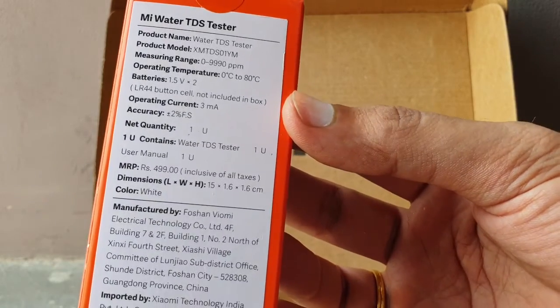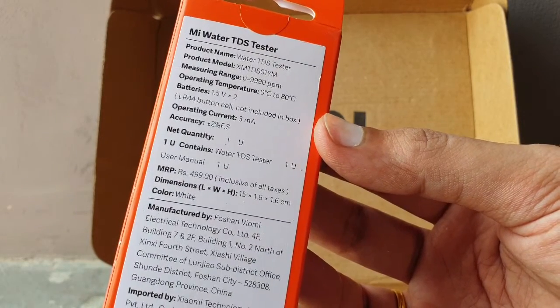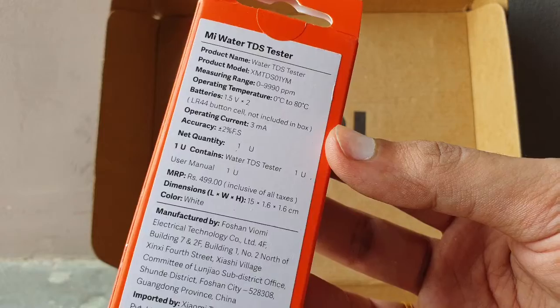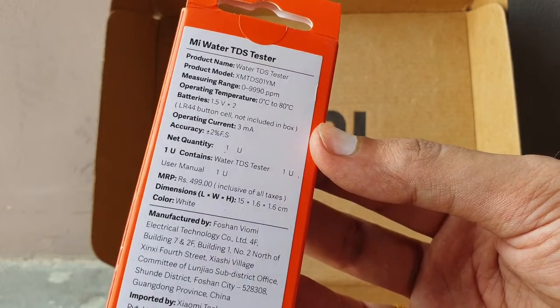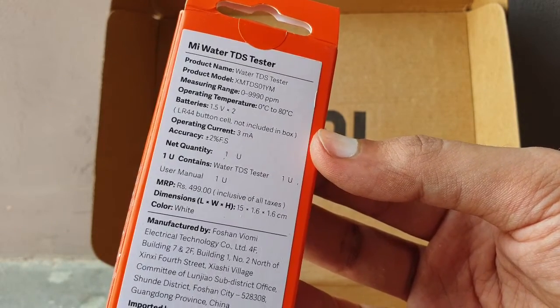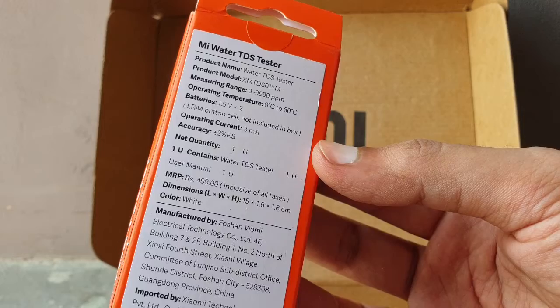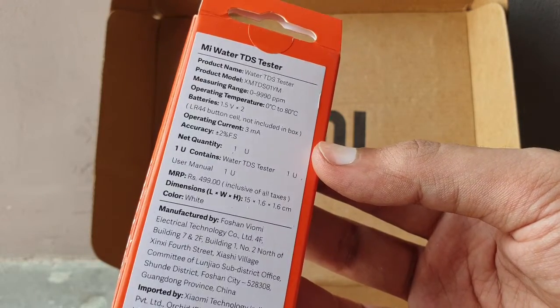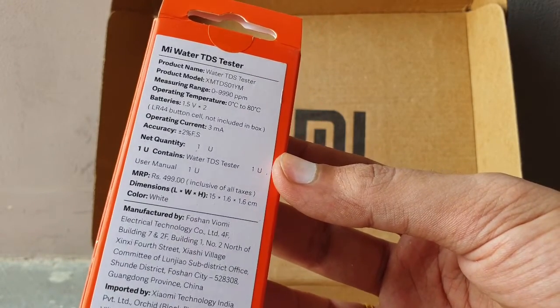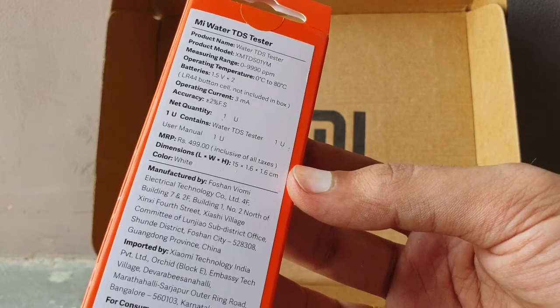The operating temperature is 0 to 80 degrees Celsius, so it can work in harsher conditions. It uses LR44 button cell batteries, which are not included in the box. You need two LR44 1.5V batteries. Current operating is 3 milliamperes and accuracy is plus or minus 2%.